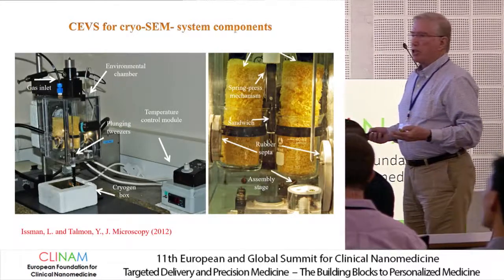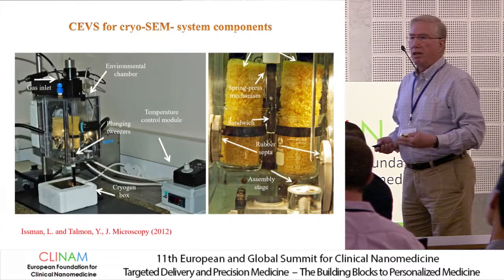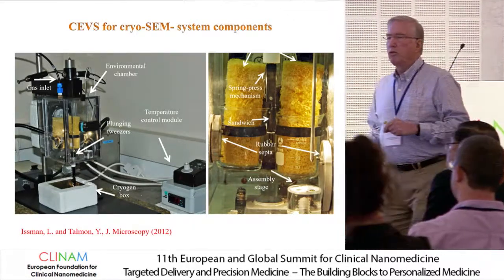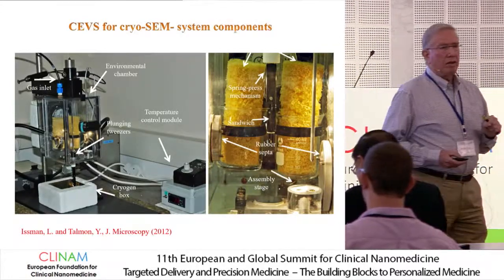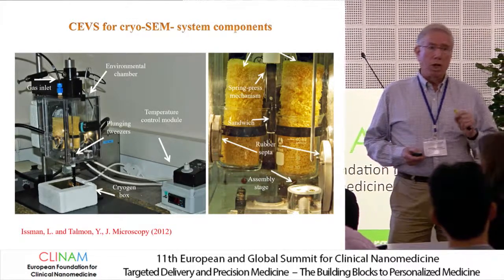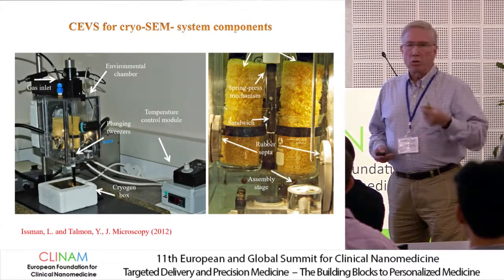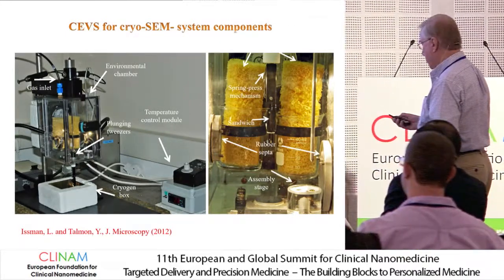So basically, you prepare the specimen, you transfer it to the scanning electron microscope, and you keep it in the electron microscope at very low temperature, and you look at that fracture surface. In addition, we don't have to use coating. If you apply the right acceleration voltage on the order of 1 kilovolt only, which you can do only with the high-resolution field emission gun scanning electron microscopes, you don't have to coat your specimen, which means that you also gain through the resolution of the system.